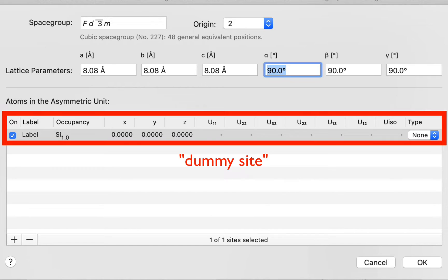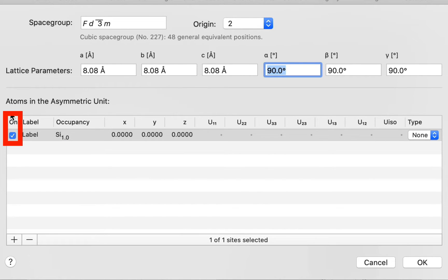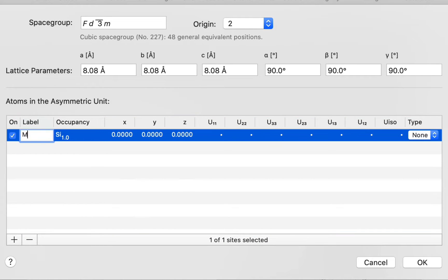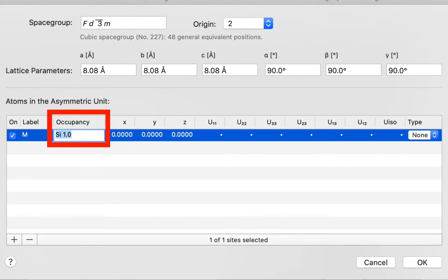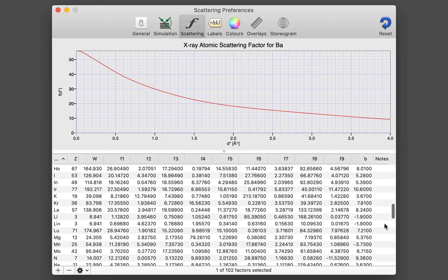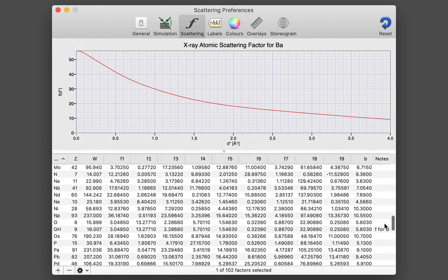We already have a dummy site — silicon at 0, 0, 0 — and I can edit these settings. From left to right we have an On column, which controls whether the site should be used for the diffraction calculation. This is a useful way of determining the effects of one site on the overall diffraction. We want it on for now. Then we have a site label, which is your way of identifying the site. I'm going to type M here, and I can tab to move to the next field: occupancy.